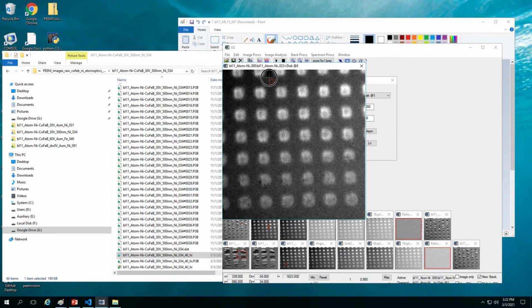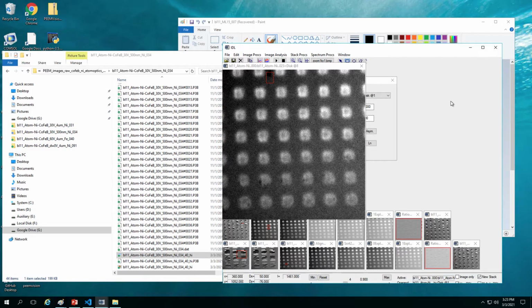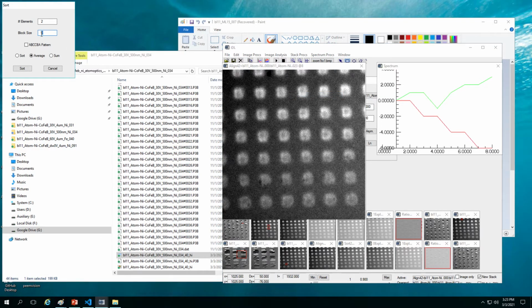And we mentioned that this is a dust we saw earlier. So I'm gonna use this guy here to do the alignment this time. Not too much on the edge. Yes. Maybe some shifting would. So some shifting of the images maybe implies later we don't even have this part in some of the images. So align, see how it goes. All right, we'll see. Sort. Block size is 4 this time.